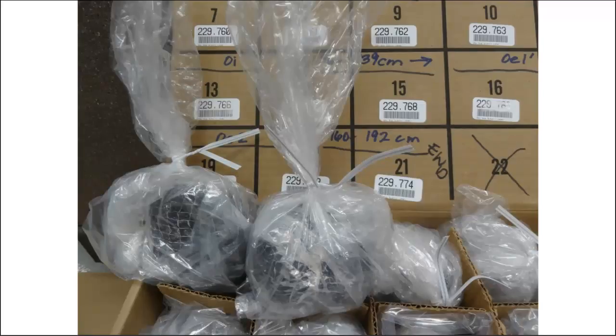And then on the clod samples, we're going to do what we typically do and put those in clod bags, which we'll provide to you. And those aren't as heavy duty, so don't worry about them being 8 mil, because they wouldn't fit in the cells if they were 8 mil anyhow. But we need to seal them shut with twist ties and put them in the appropriate cells.